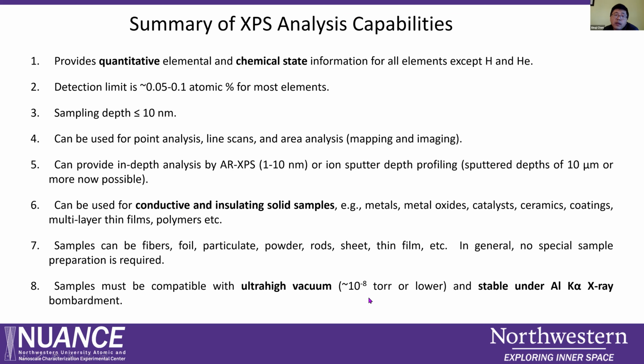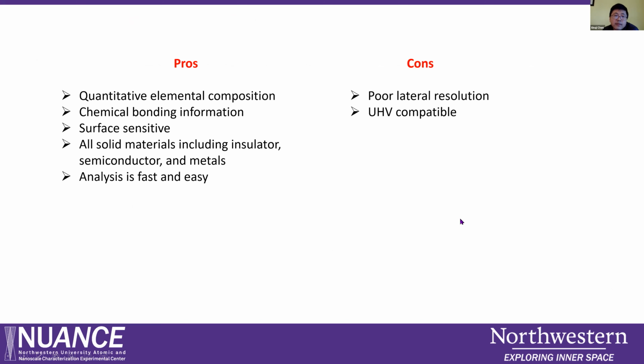The sample has to be compatible with ultra high vacuum. Any liquid, gel, or sticky samples that can destroy the vacuum cannot be loaded. Also, the sample has to be stable under the X-ray. If the X-ray bombardment makes something degrade or change, you cannot run that.